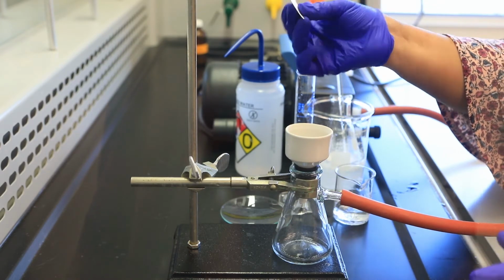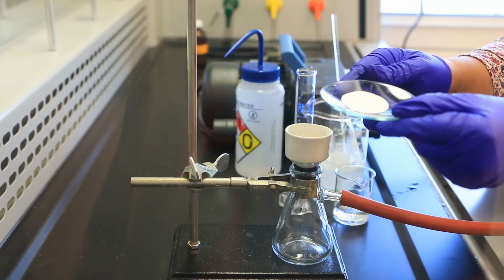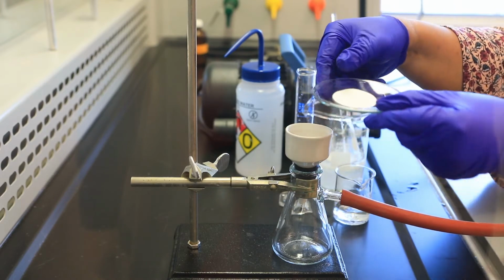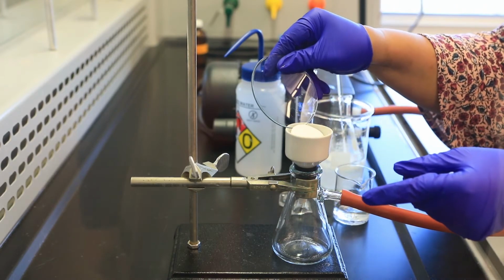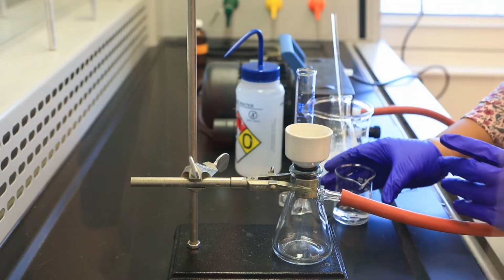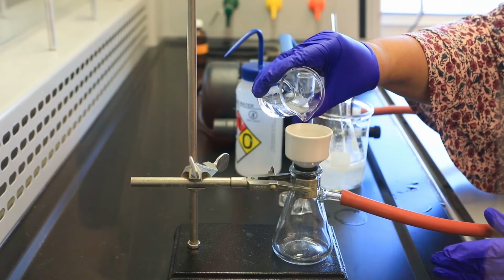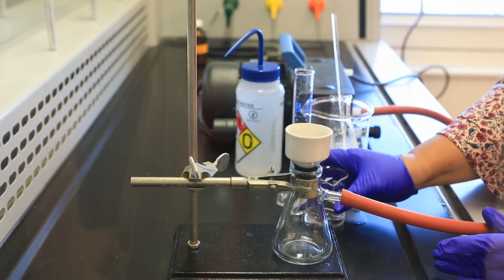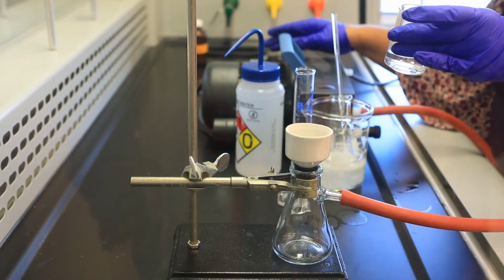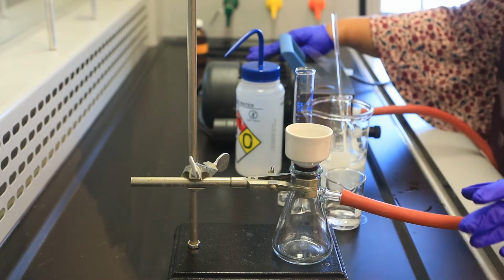I've already pre-weighed our filter paper and our watch glass. I'm going to transfer that pre-weighed filter paper to the Büchner funnel, and just to make sure that it stays in place, I'm going to add 1 or 2 mL of water to hold the paper in. Please note, I'm using this one for chilled water. If I use warm water, that will actually hydrolyze the product.